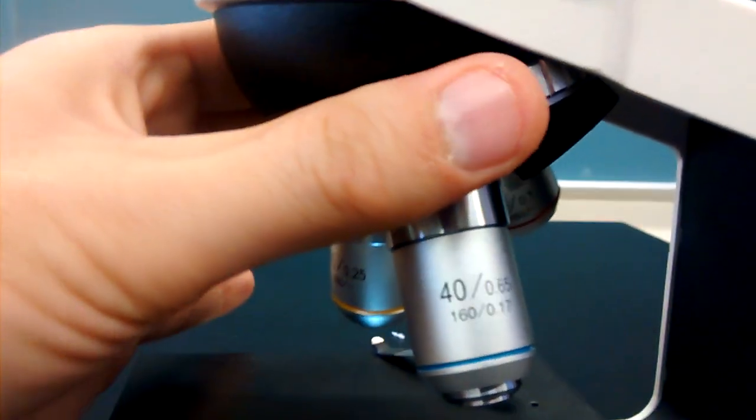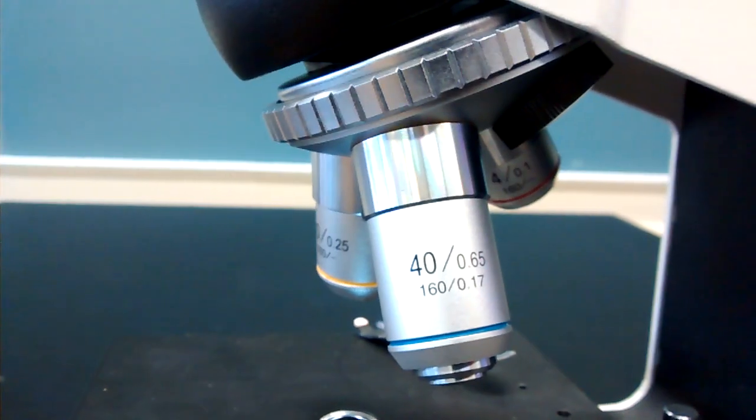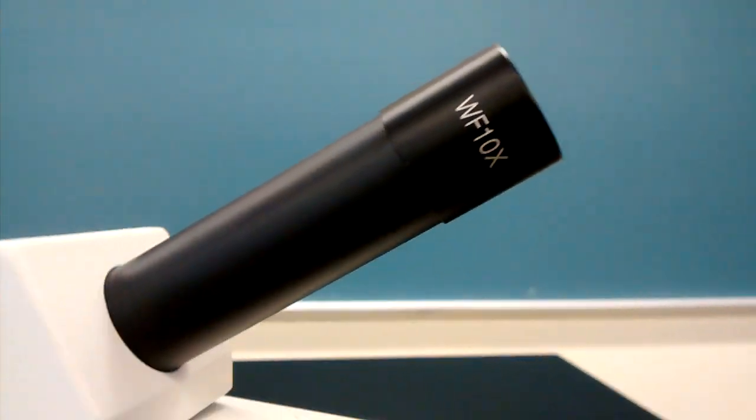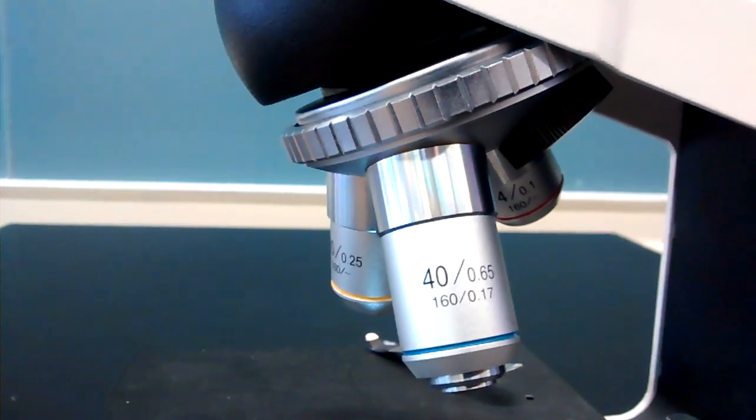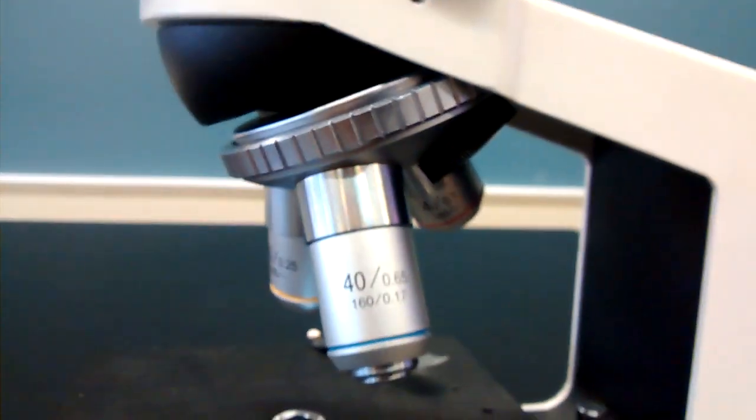And the high power, the rule is the same. We get 40 times magnification with that. Multiplied by the ten times of the eyepiece lens, we get a total magnification of 400 times compared to the unaided eye.